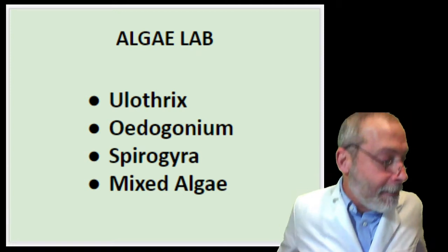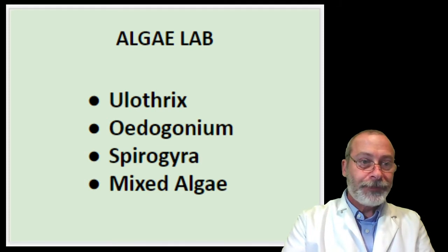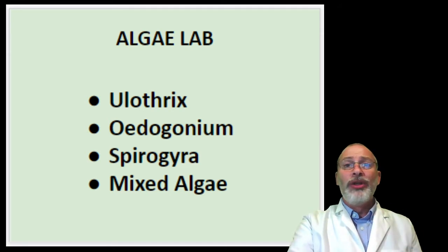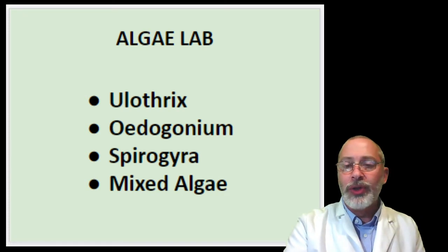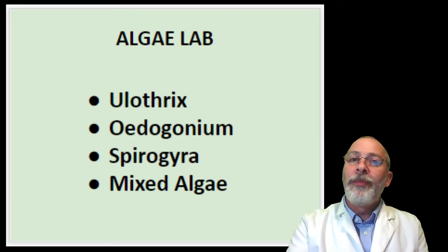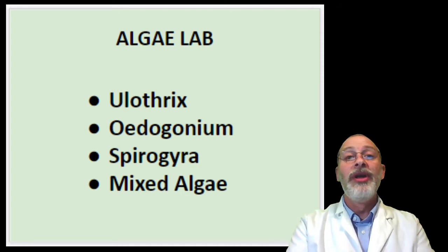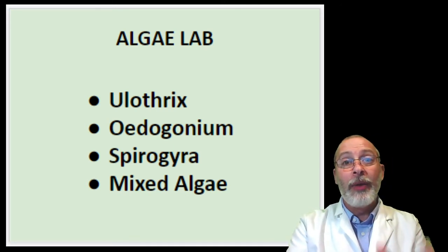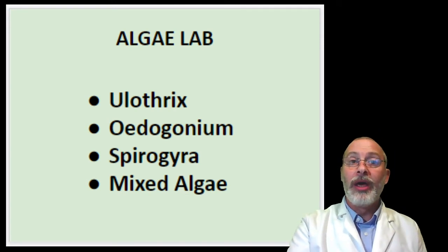So let's proceed now in our observation section with an illustration of each. For each of these samples, I'm first going to show you a picture of what it looks like in the real world, in water, in situ, they might say, or in solution. You don't have to draw that. Then I'm going to show you what it looks like under magnification for low power, and then under high power. As I show you each, I would encourage you to pause the video as long as you need to in order to draw what you observe.